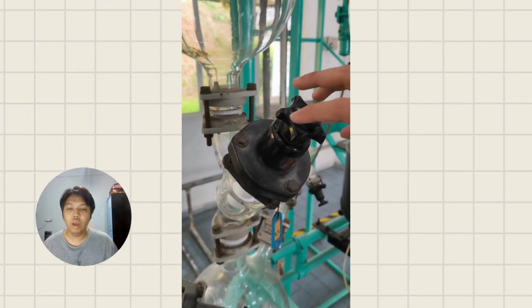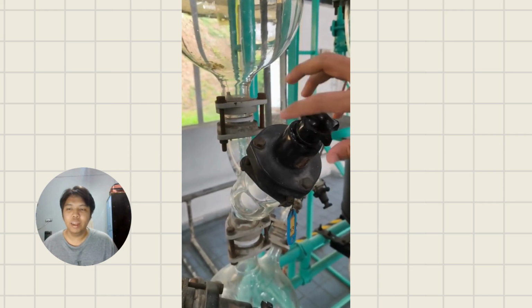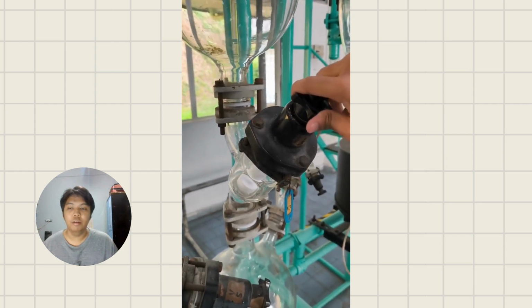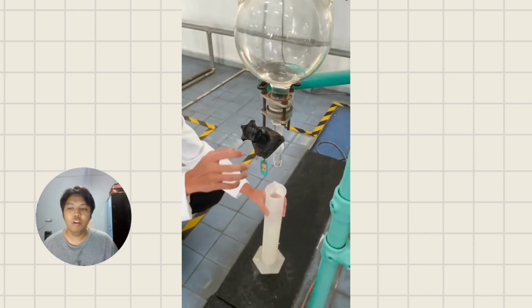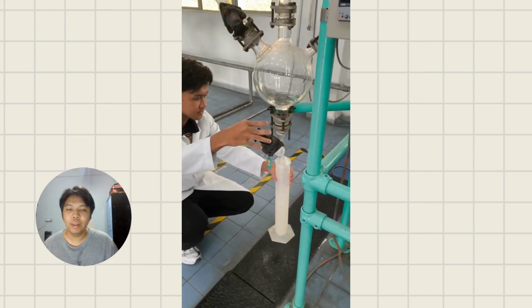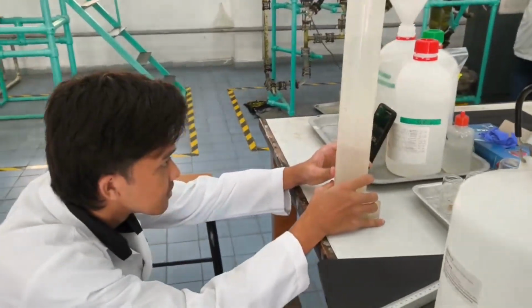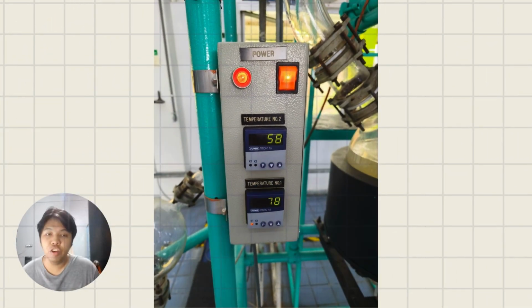Every 5 minutes, we take the temperature of the mixture, the temperature of the distillate, and the volume of distillate. The volume of distillate can be collected by opening the valve below the flask and collecting it into the measuring cylinder to see how many ml of distillate product was yielded within the 5 minute period. The temperature of the mixture and distillate product can be read from the electronic thermometer at the apparatus.